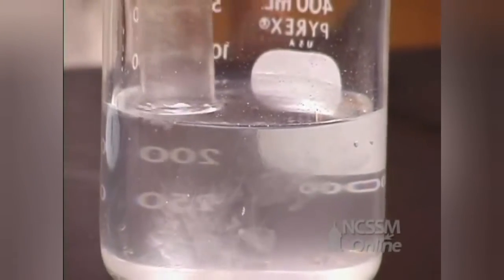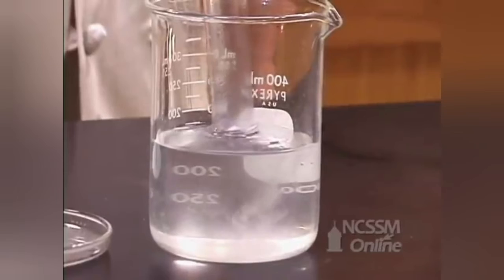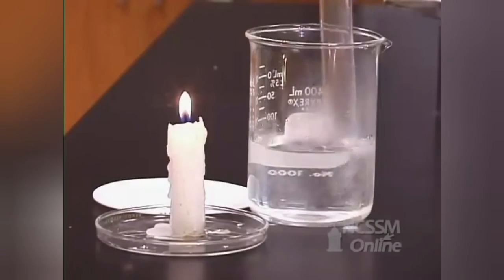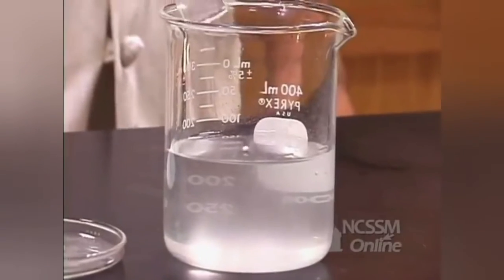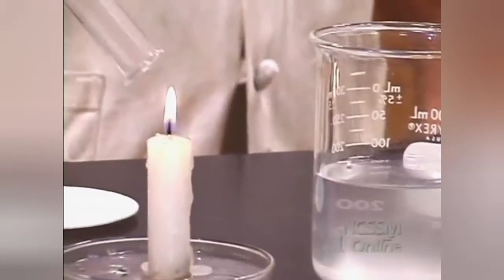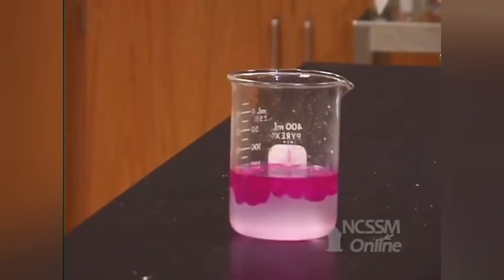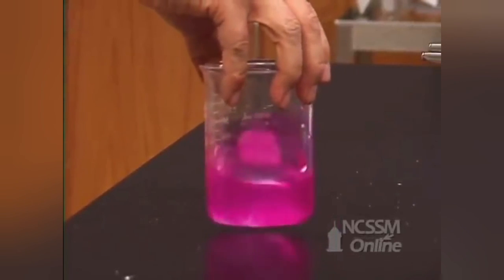We can again test that hydrogen gas is being produced by this single displacement reaction by trapping the gas and testing its flammability. We can test for the fact that we produced sodium hydroxide by adding phenolphthalein. The phenolphthalein turns a purple-red color.